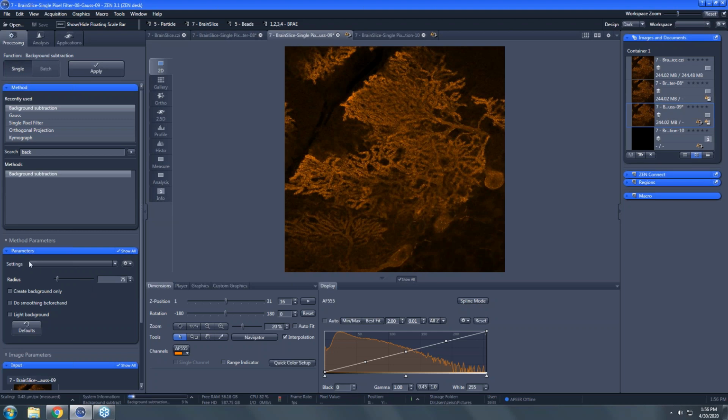Last question here. Under background subtraction, other options, say only smoothing. We have audio issues when we're doing background subtraction. Oh, right. Okay. So you're very choppy to me. My apologies to the audience. Yes, likewise. We're almost halfway done. The processing power required to do subtraction.